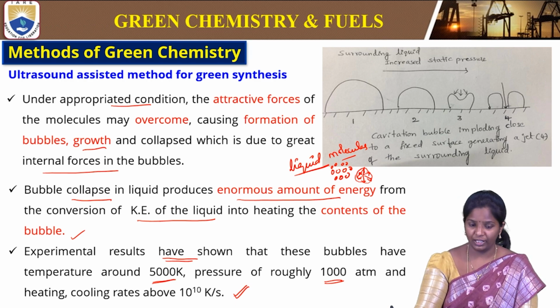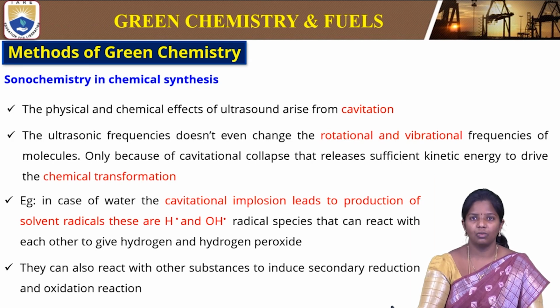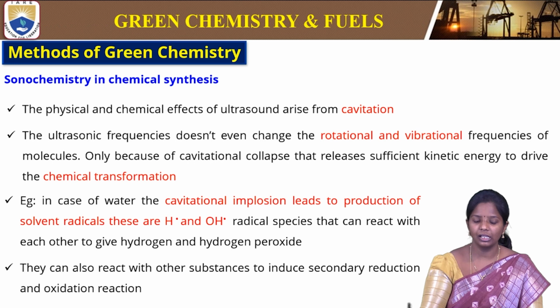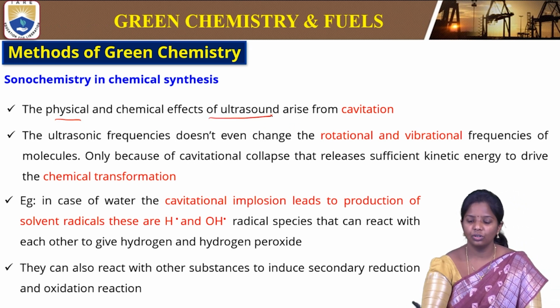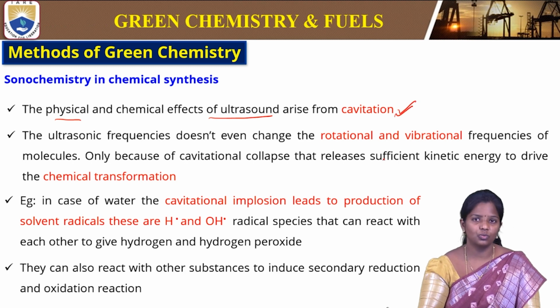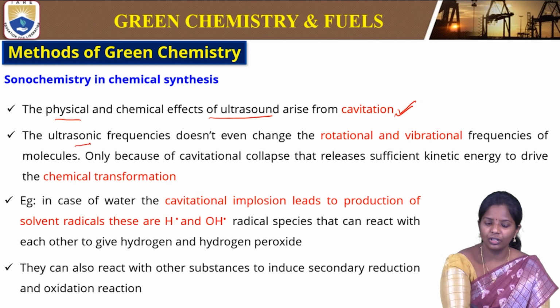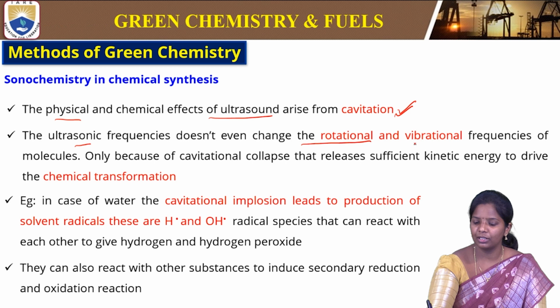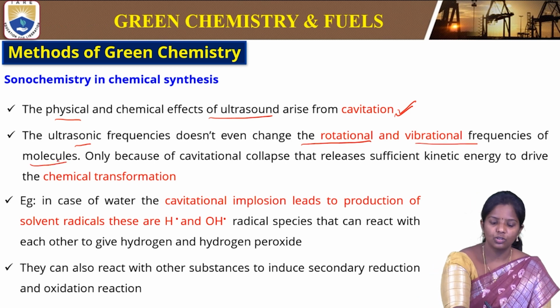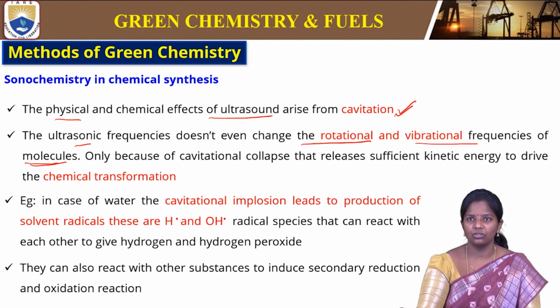So how does sonochemistry in chemical synthesis take place? Because of physical and chemical effects from the ultrasound due to the cavitation phenomenon, which we have already discussed. The ultrasonic frequencies do not even change the rotational and vibrational frequencies of molecules. The molecule's rotation or vibration is not changed by these ultrasonic waves.